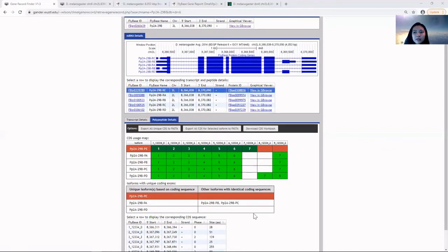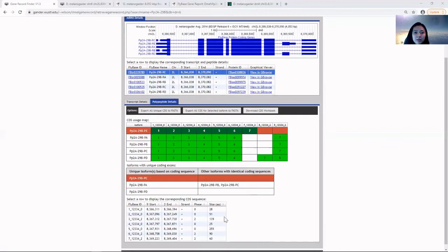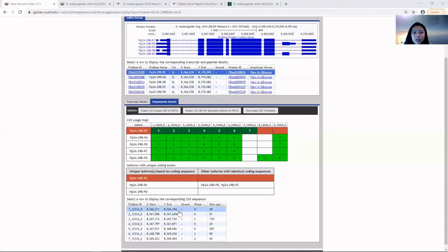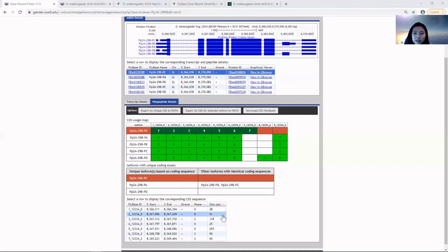The last table shows the details of the unique CDS protein sequence corresponding to each isoform.